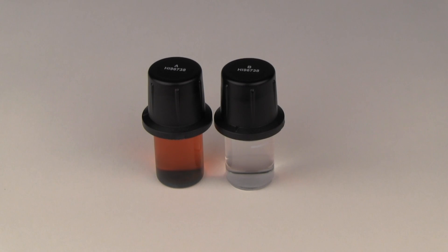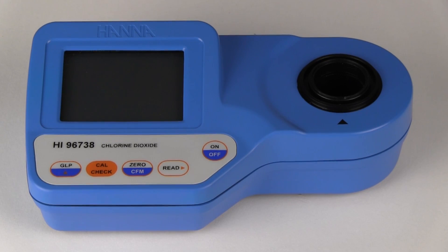In this video, we are going to demonstrate how temperature affects the reading of CalCheck standards in Hanna colorimeters. We will be demonstrating with the HI-96738 portable colorimeter for chlorine dioxide.